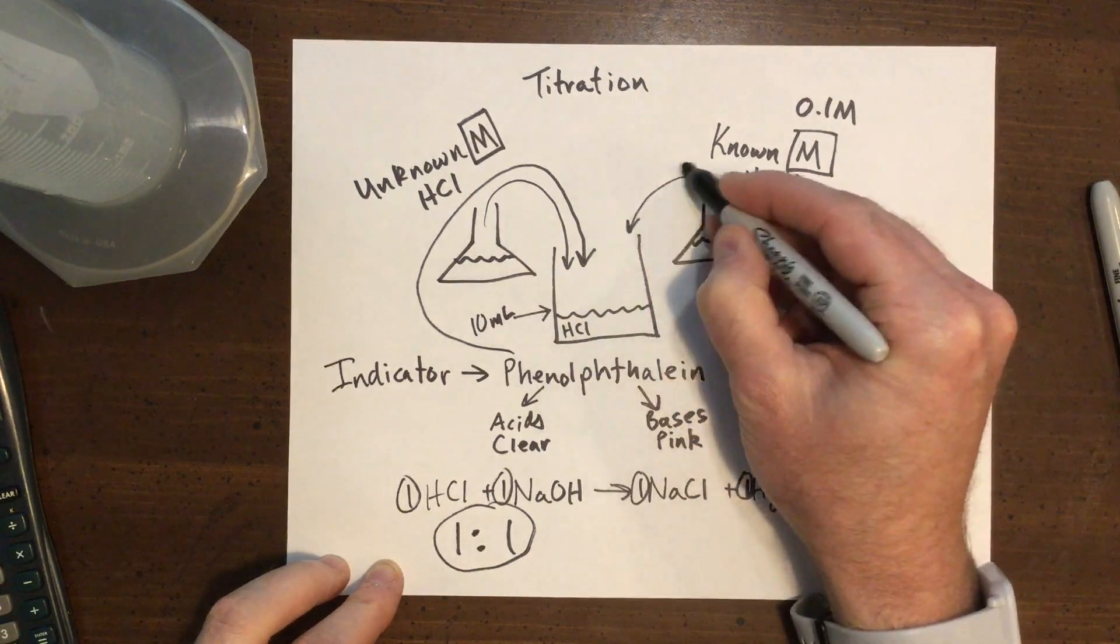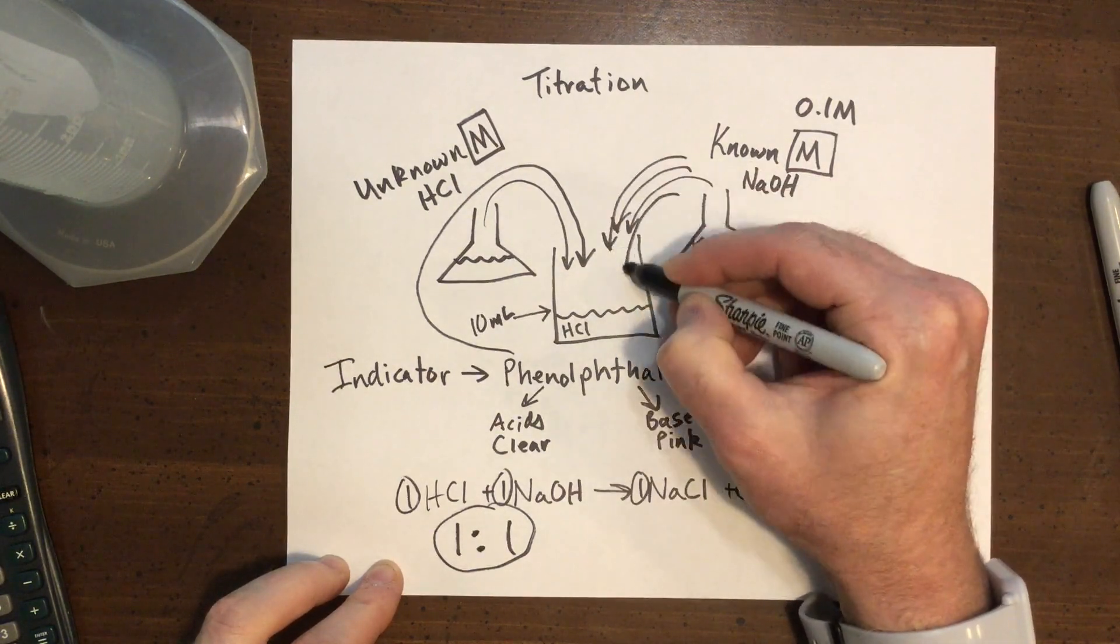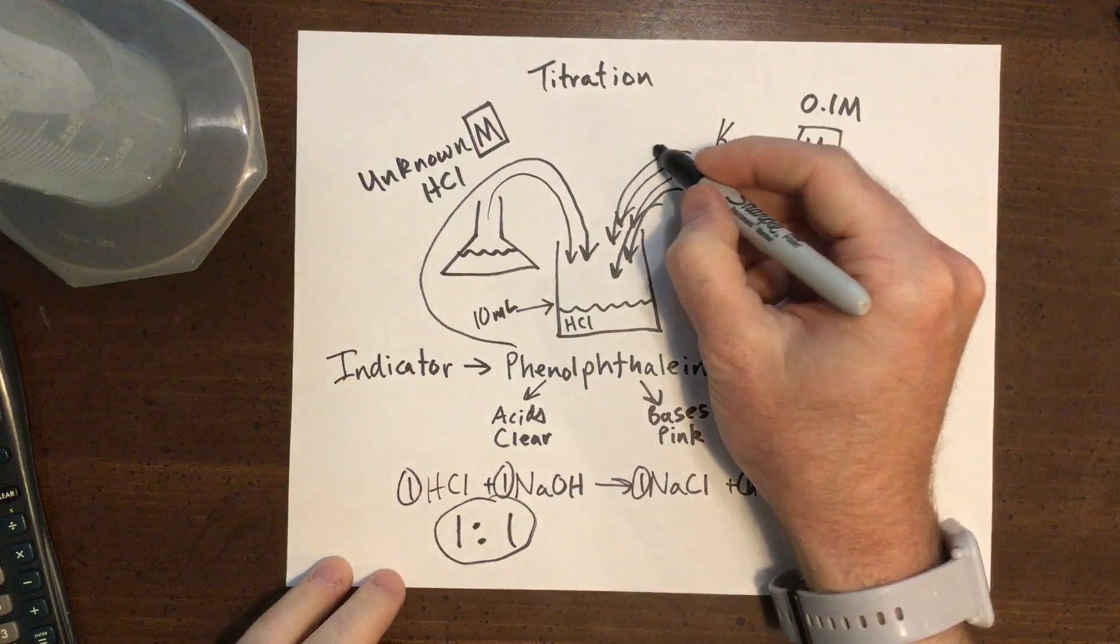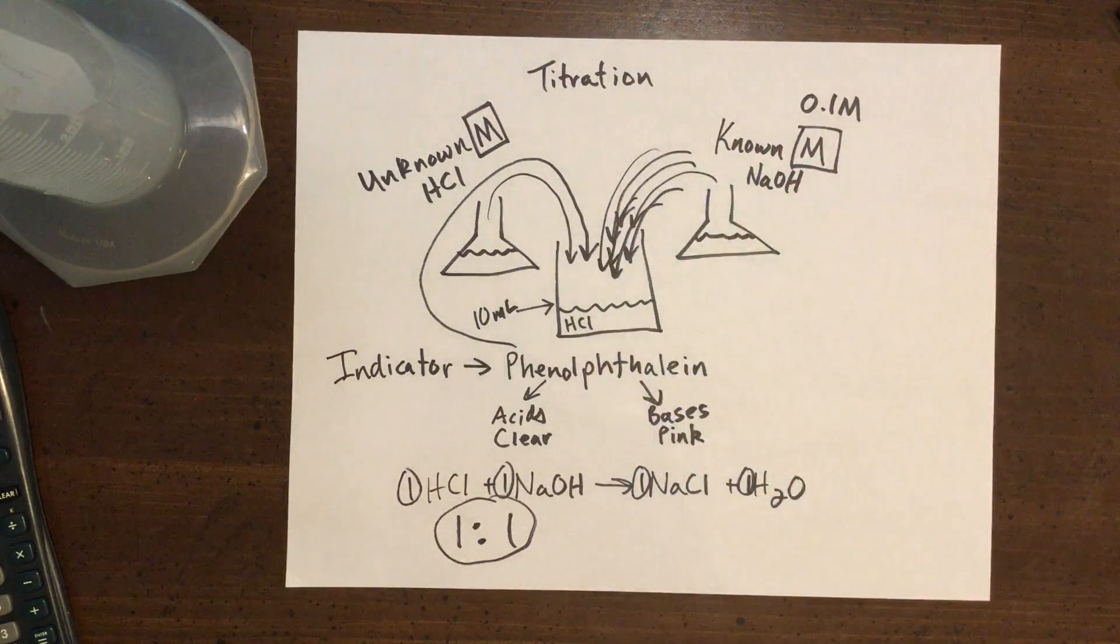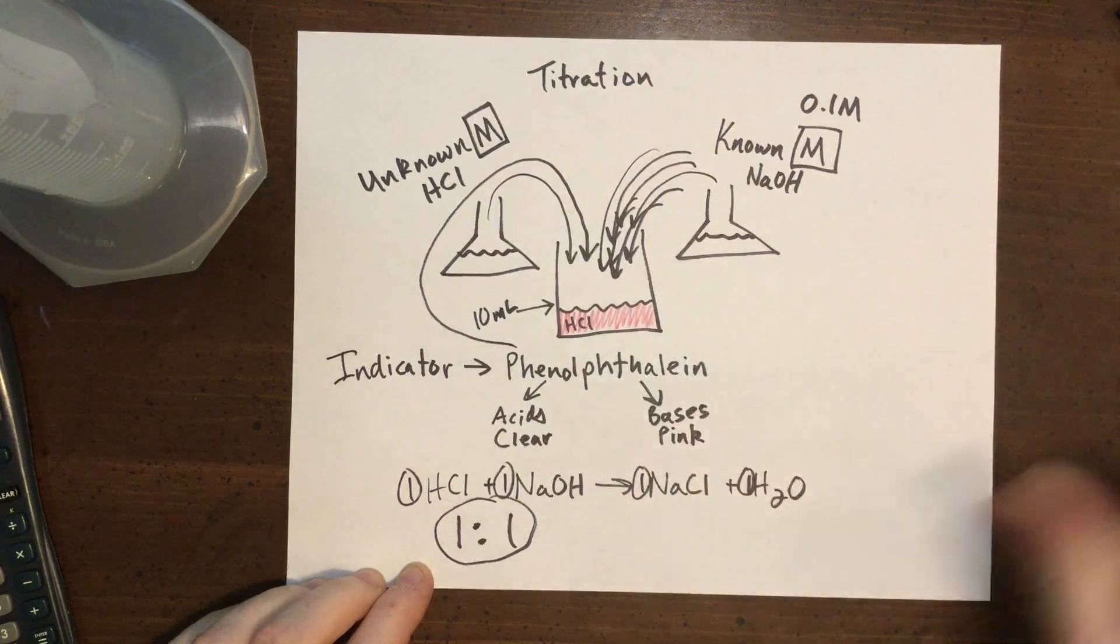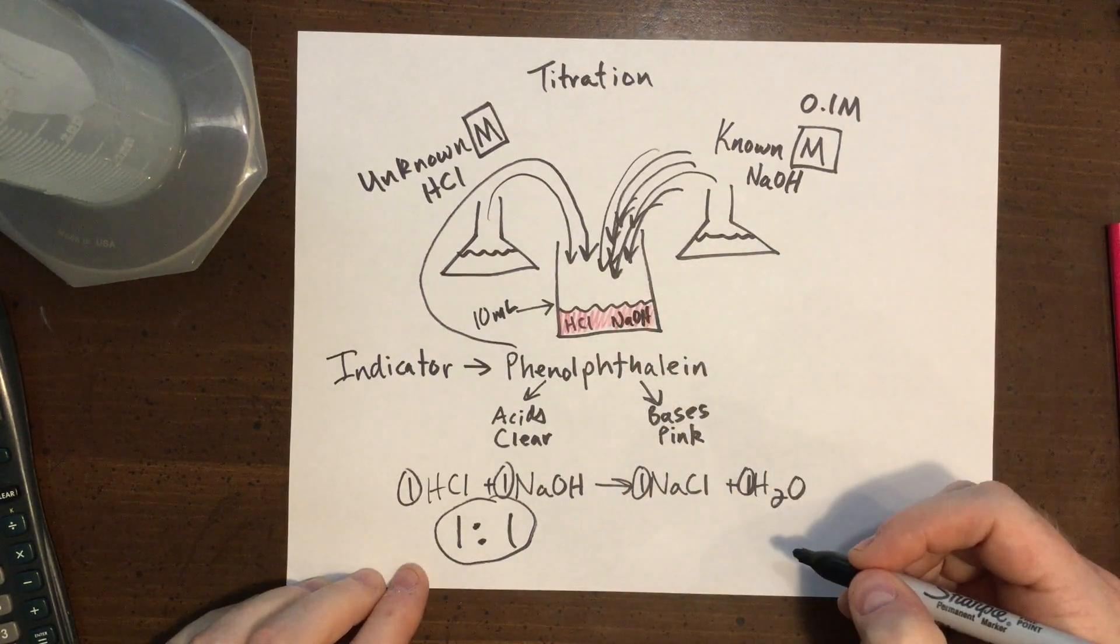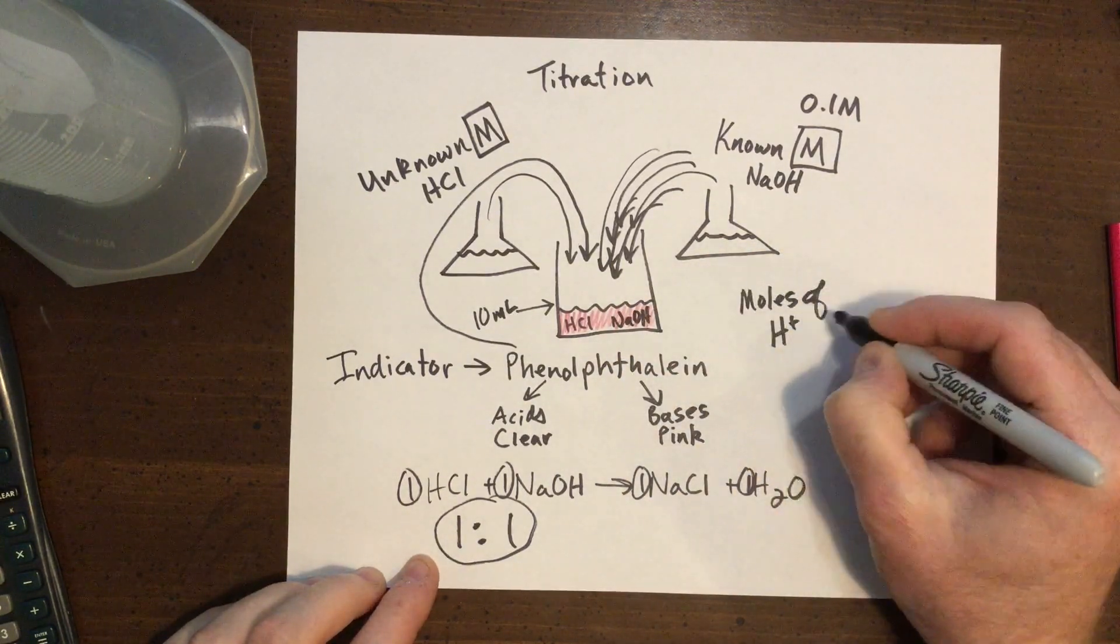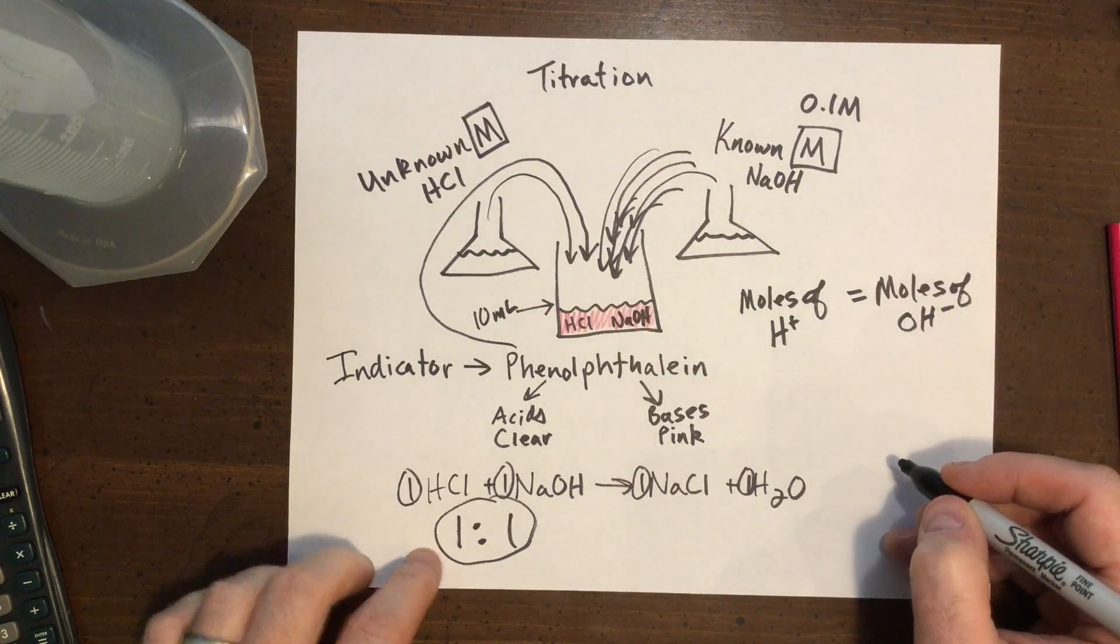So I'm going to slowly be adding the sodium hydroxide over. As I add it over, it's going to stay clear as long as hydrochloric acid is winning. But at some point in time, I'll have added enough sodium hydroxide so that they're actually winning. Then the solution will turn pink. Right around this time, you can say that the moles of hydrogen are equal to the moles of hydroxide.